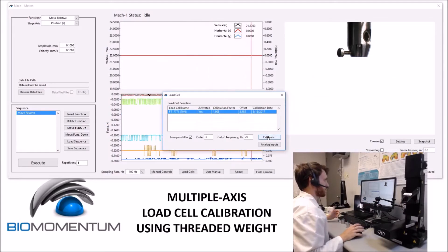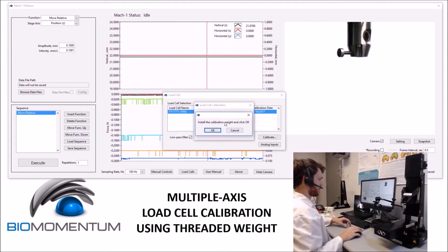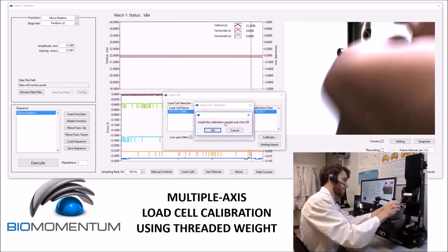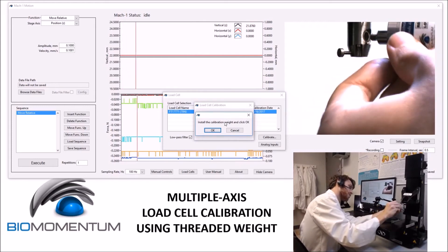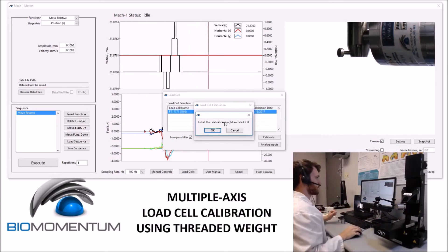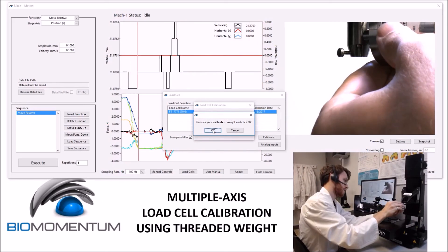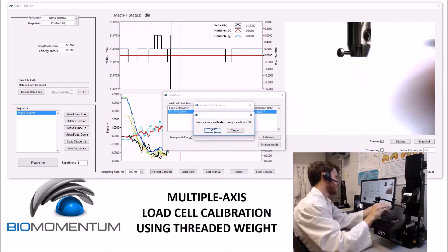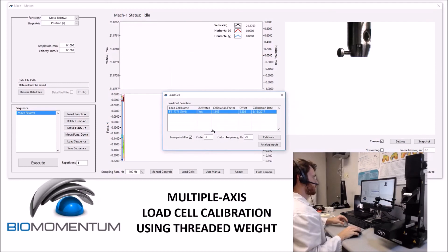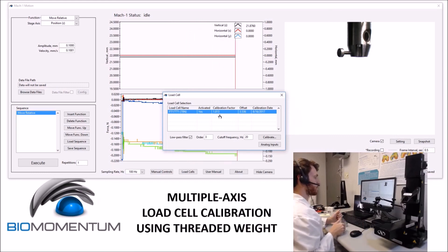The second method to calibrating the multi-axis load cell is to select calibrate, select a threaded weight, and then follow the instructions on screen. The calibration weight will be placed into the side insert on the multi-axial load cell. The instructions will be followed on screen, being careful not to damage the load cell. The calibration factor will again be within 5% of 1.00, from 0.95 to 1.05.